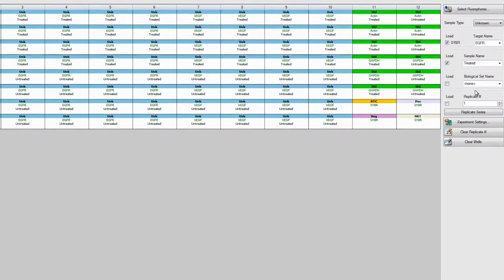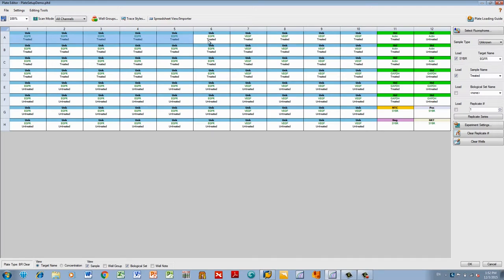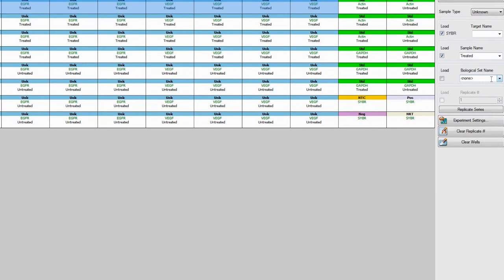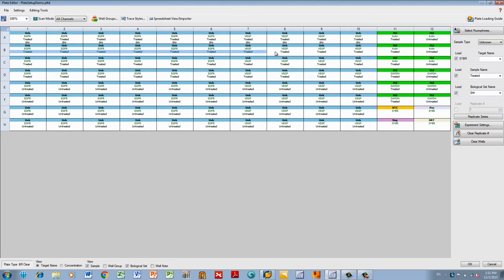Select the wells in the first biological set. Under Biological Set Name, type in your parameter and press Enter. The drop-down menu is pre-populated with time course labels and our first biological set is zero hour.